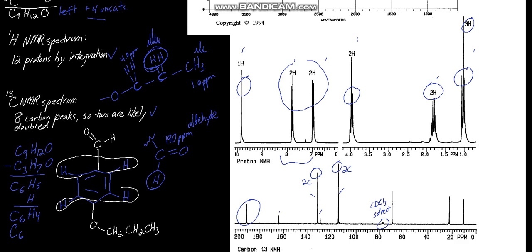Okay, so what else can we point out? Other key features. These 2 little much shorter carbons. That is typical of quaternary carbons. What are quaternary carbons? Carbons without any hydrogens attached. Those likely are the points of attachment of these 2 substituents. The 164 ppm has got to be the more de-shielded carbon that's attached directly to oxygen. So overall, you want to use a systematic method like this. There's our 4 aromatic hydrogens, nothing left.